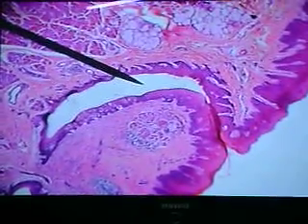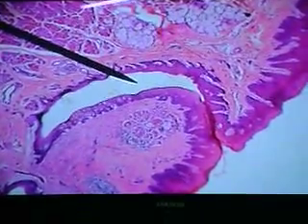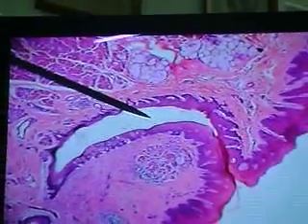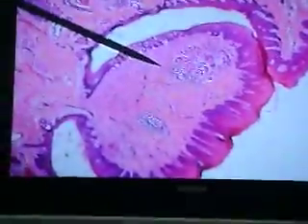Okay? So at the junction just anterior to the sulcus terminalis, there are about a dozen of these papillae. So this is a beautiful platinum slide. Not gold, but platinum. Alright. So, like good wine, we will savor it. Take our time with it. Alright? So there we see, beautiful. This cannot be better. I'm very happy.